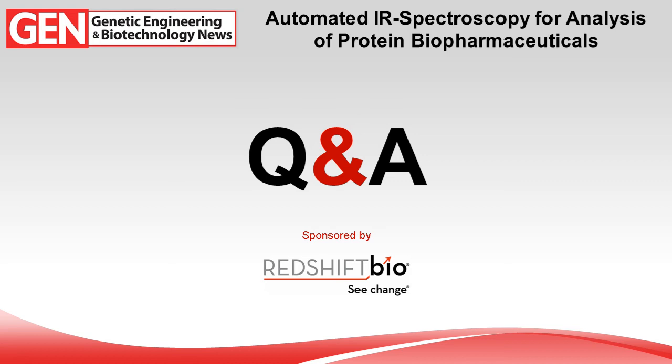All right, thanks, Dave. Next question we have is for Lucy. Lucy, an audience member says that the auto-referencing and buffer subtraction is an interesting feature of the technique, but the description of how this works and why it's superior, if it is, to traditional baseline subtraction is unclear. So maybe you could describe that a little more?